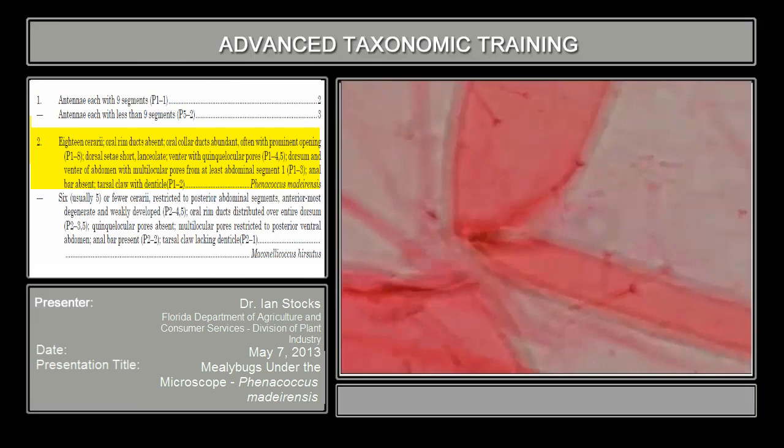But in this species, those cerarian type setae there will have trilocular pores. So that's how we're actually able to establish if this is Phenacoccus madeirensis, the Madeira mealybug. And there, the corresponding illustration for the plate is plate 1, figure 6. The flame-like cerarian setae, a bit larger than the dorsal setae, the very evident socket, and then the trilocular pore surrounding it.